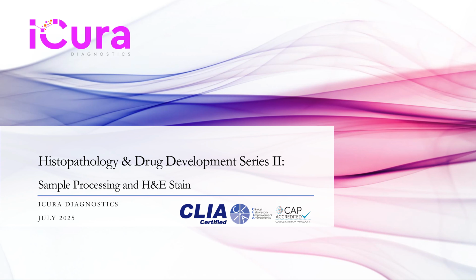Hello everyone. Today's topic is Histopathology and Drug Development Series 2. We're focusing on sample processing and H&E stain.